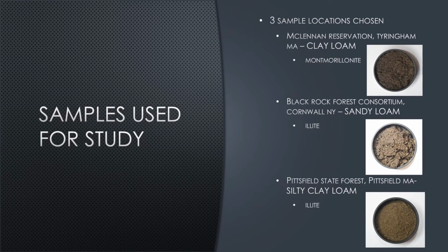The initial soil samples that were collected were not contaminated. I actually added in different percentages of contaminant to each sample. So the soil samples collected all came from different locations, and shout out to the University of New Hampshire for going out and collecting these samples for me.